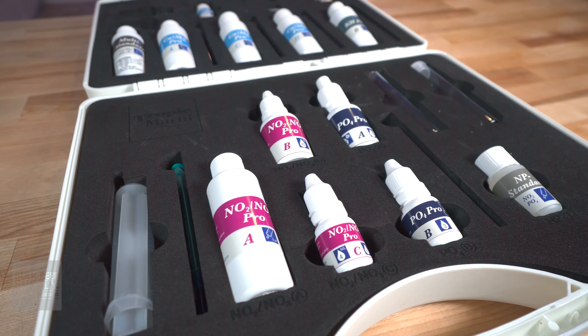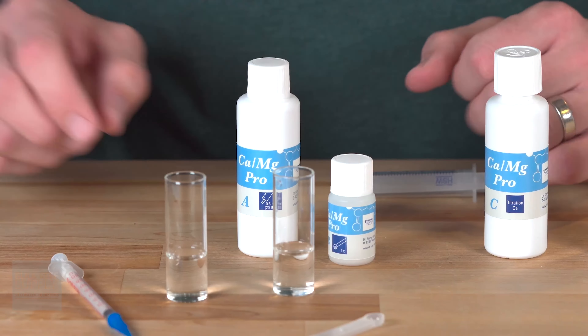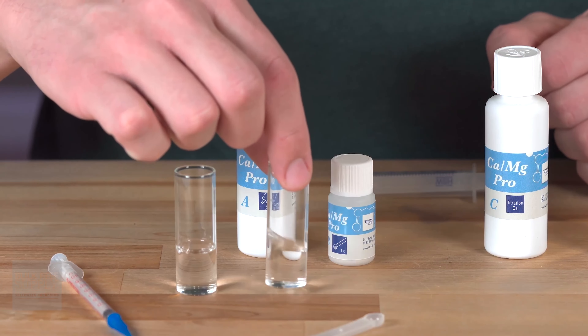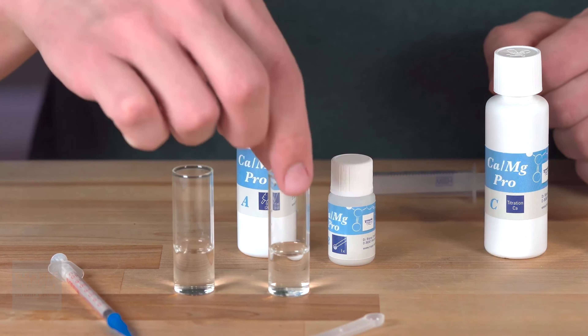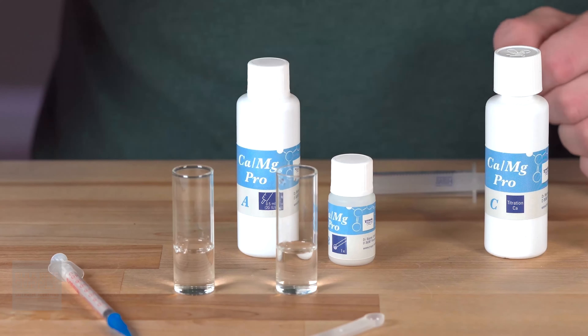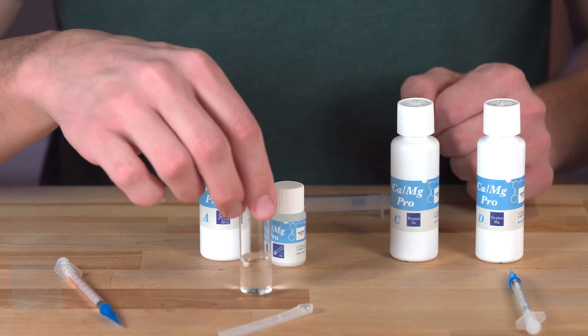These tests, like all titration tests, are a couple steps long and include some form of mixing along with adding reagents. One unique feature about Tropic Marin's tests is that you can actually test for calcium and magnesium in the same test with the same water — I'll demonstrate that now. First, you're going to need one 5-milliliter sample in cuvette A and another 5-milliliter sample in cuvette B.